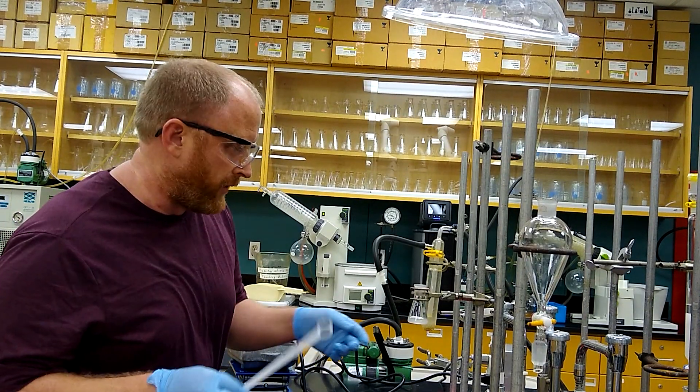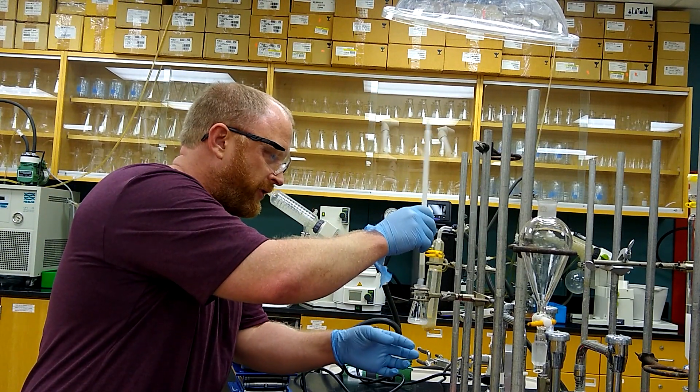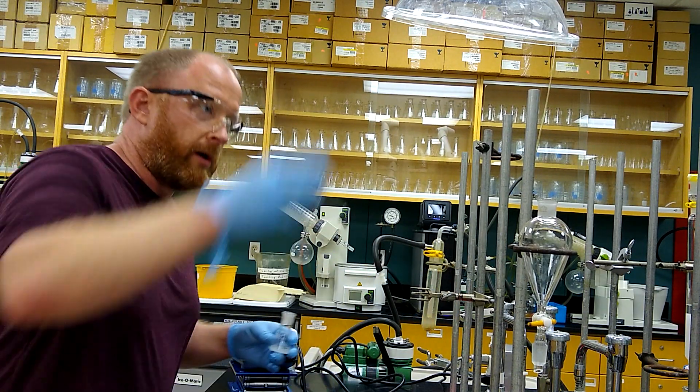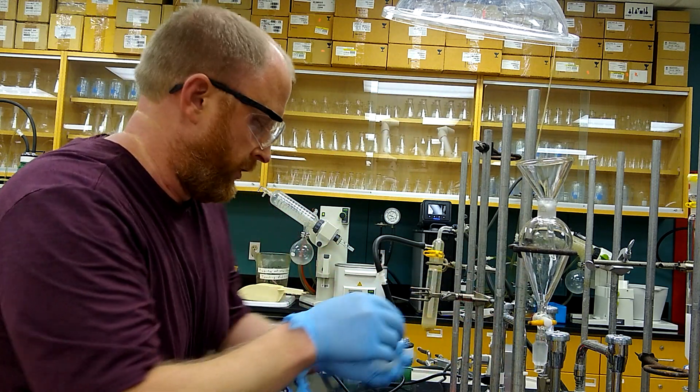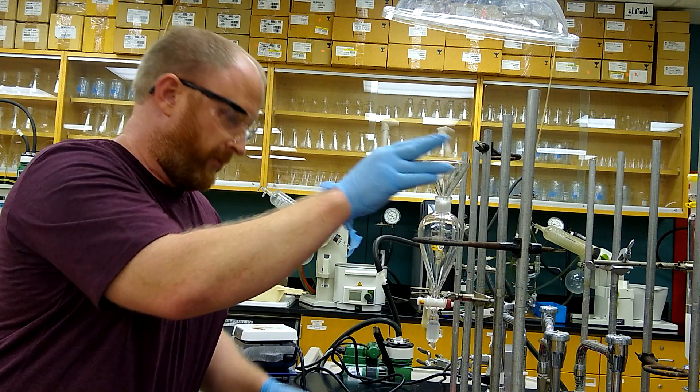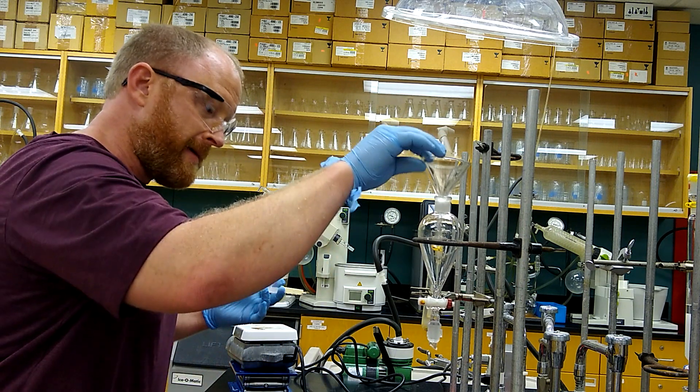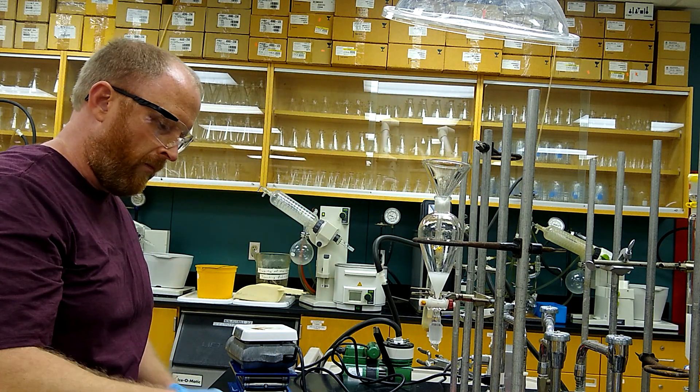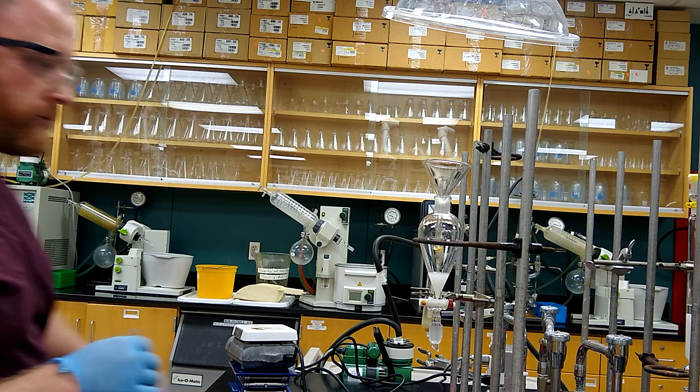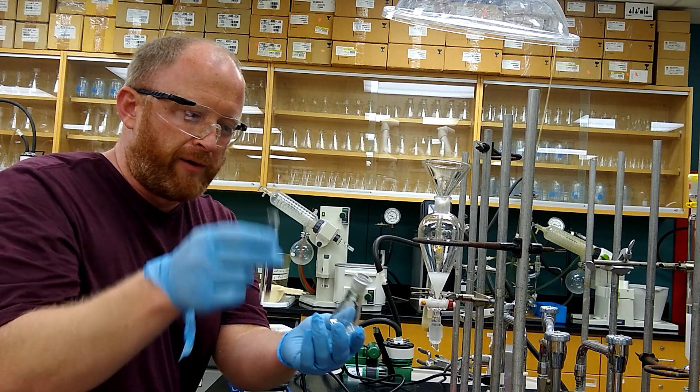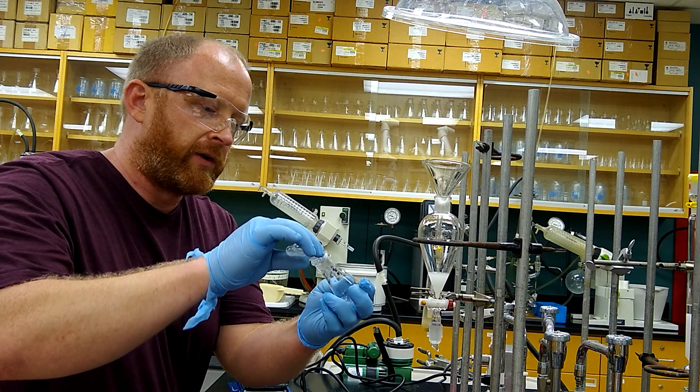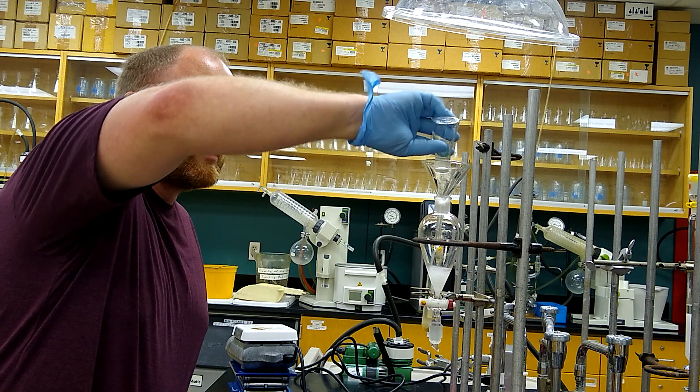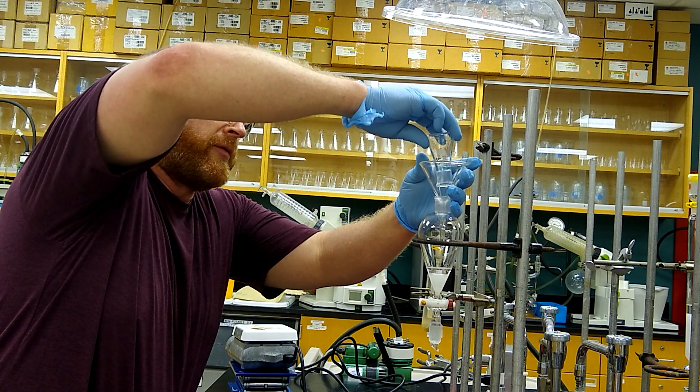Now after letting our reaction cool, I'm just going to fish out my stir bar and we'll transfer this over to a separatory funnel. I'm going to use about 5 mL of ether to rinse that flask, and then we'll transfer that out of the flask.